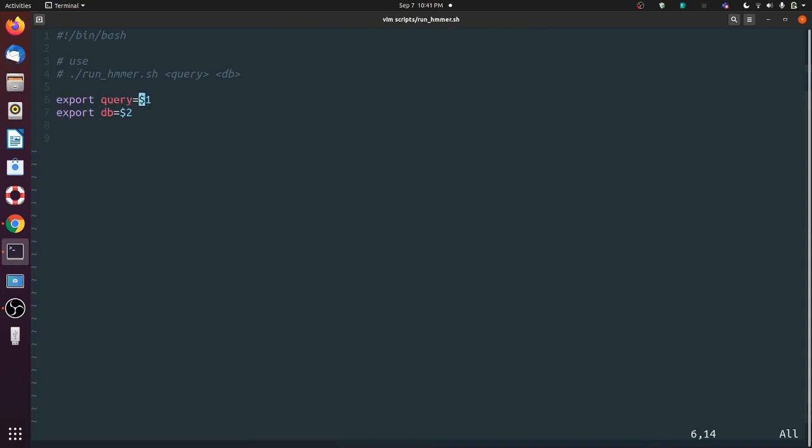In this case, we expect this to be a FASTA file, and then the database FASTA file as well. The query for us was the sequences we gathered from UniProtKB, which is the bat proteins. And then we first use muscle.